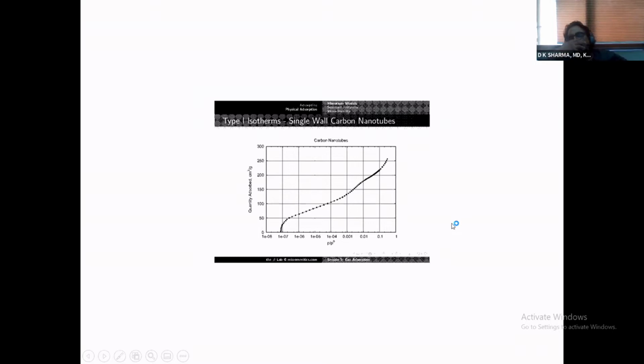This is also the reason why certain initial thoughts pertaining to adsorption in the micropores arose. People thought that micropore adsorption means as soon as you reach a particular pressure, a particular size of micropore will fill immediately. Then increase the pressure and another micropore will fill instantaneously. There is no instantaneous filling here.